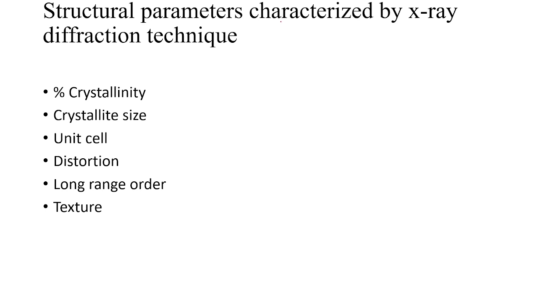Now, what are the different parameters we characterize through XRD? Basically, wide angle XRD. Wide angle XRD means the angle that we scan is around 5 degree to 90 degree. Next, we will discuss small angle. For the time being, for wide angle, as we are discussing right now, the angle is around 5 to 90 degree.